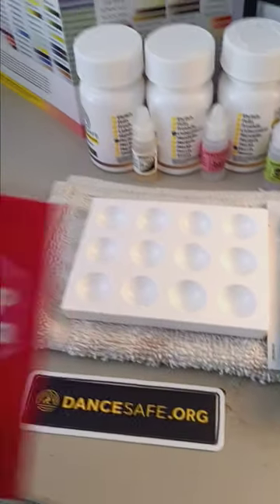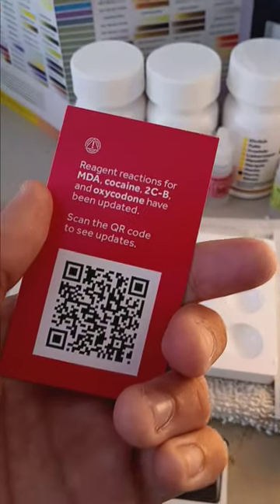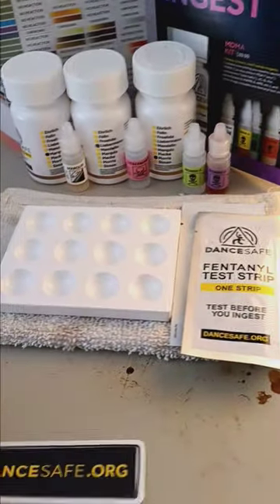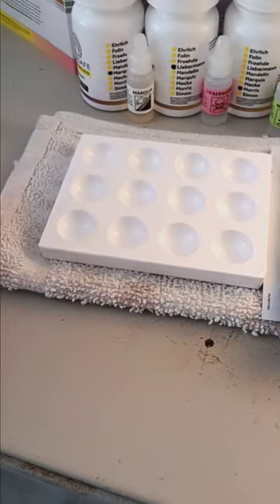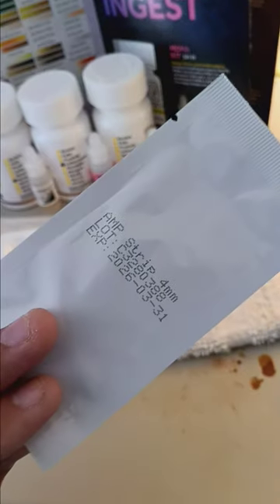Right once you open the box, you're going to get this little 'Stop, read this first' DanceSafe.org card. You're going to scan that code, and you're going to see all the new updates they got for this kit and others. You get the free DanceSafe.org sticker. On top of that, you get one free fentanyl test strip, as well as one free amphetamine test strip.